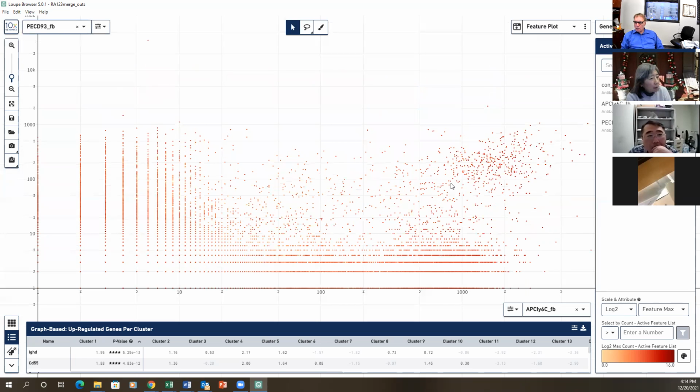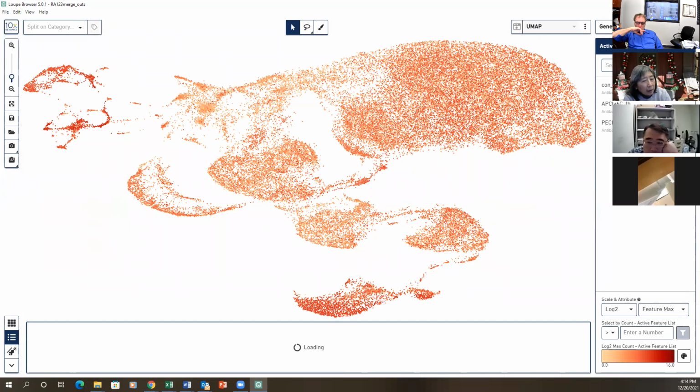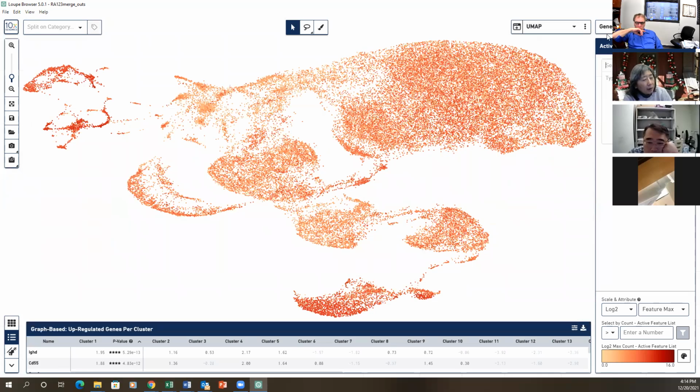I think the line is not that obvious, right? The line is the cell number. I think that's because there are too many cells. If you look at the individual file, you don't see the line. I remember the individual file. Yeah, but for now, let's use this so at least we can see they are there, right? So here it makes it more clear.